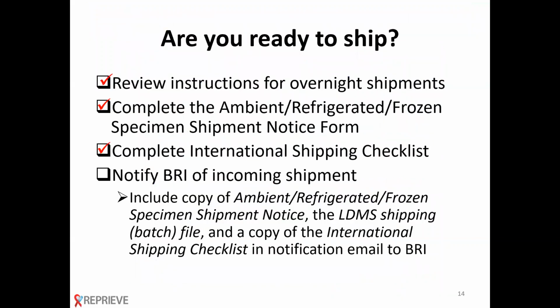And once all three of those checklists are in place, the forms and checklists, you will notify BRI of the incoming shipment. Include a copy of the shipment notice and the international shipment checklist. You want to email your shipping file, your LDMS shipping file, to BRI as well. So that is submitted electronically to BRI. They do not take physical discs anymore.